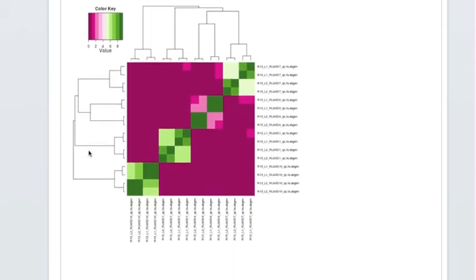An analysis of cross-sample clones asks for every file that I uploaded, which other files share common antibodies. And you can see that there are basically 4 bricks that are created here. What's happening is that this is gathering a set of mid-7, mid-4, mid-1, and mid-10. And those are the barcodes for the 4 different twins. The double groupings you see here reflect groupings of technical replicates and groupings of biological replicates within individuals. This is basically recapitulating the research that was performed in the study, showing that people produce mostly individual antibodies with very little overlap.